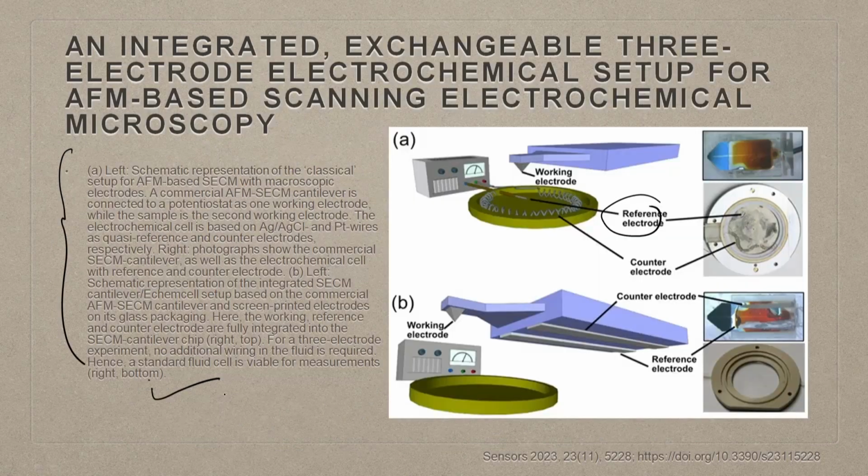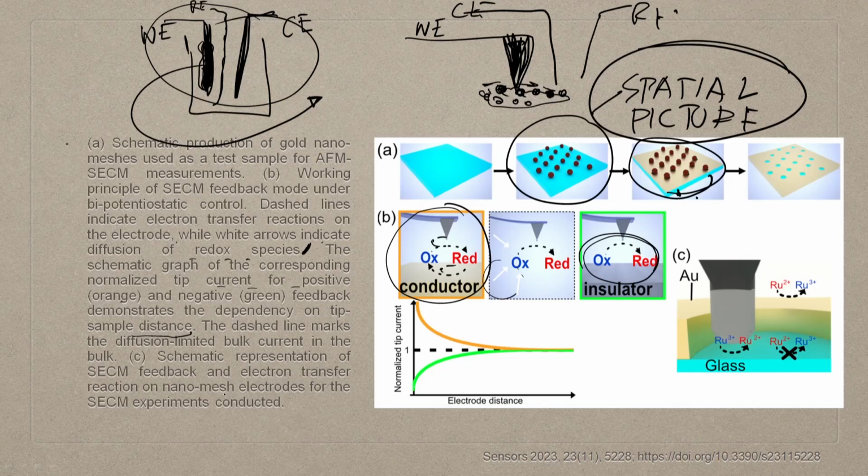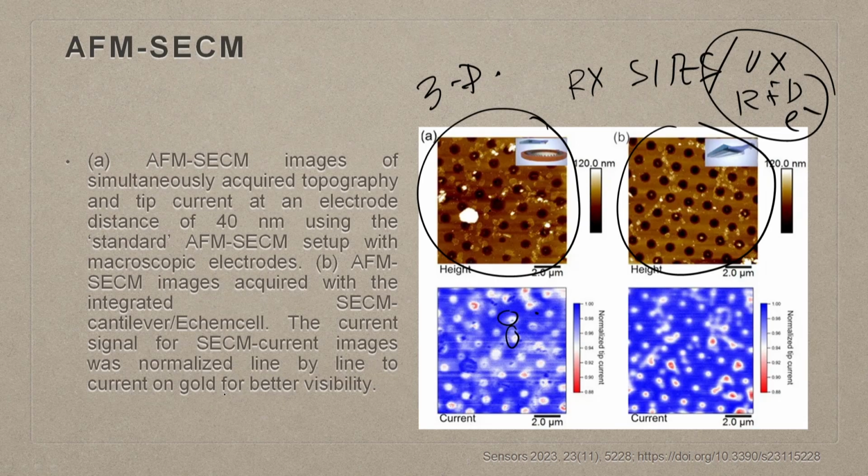From there we moved on to the lecture where we talked about how you can transform an electrochemical setup into a very powerful electrochemical setup integrated with an AFM tip, so that you get dynamic movement of electrons on a surface. So that's where we are concluding this week, and in the next week we'll go deeper with other different tools.